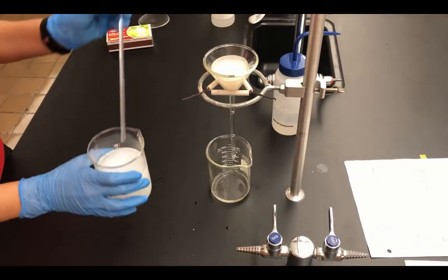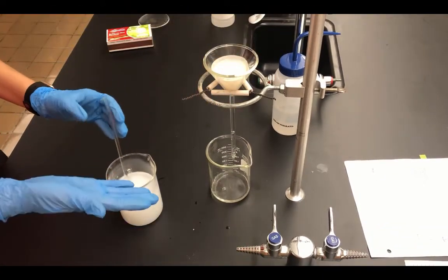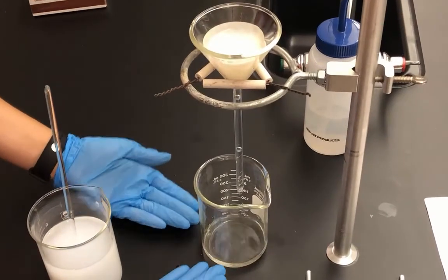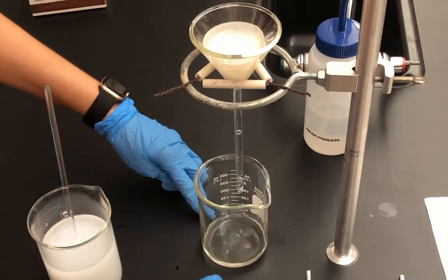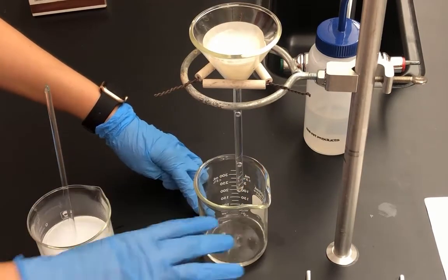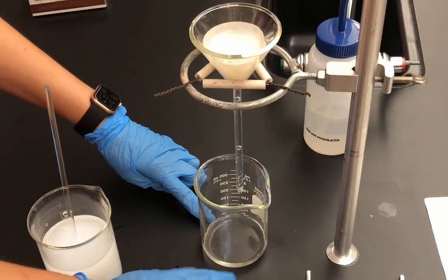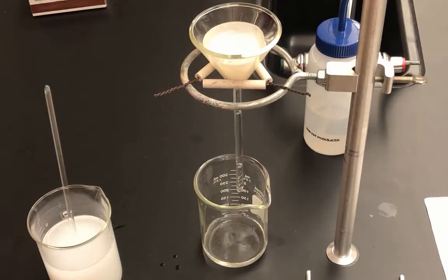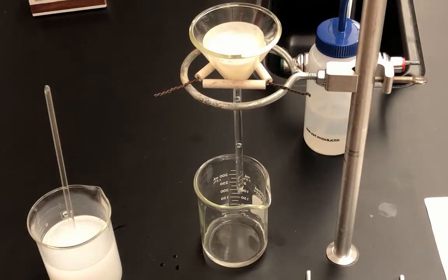Now I want you to make some observations. First, make an observation of the filtrate. So what is in the beaker down here is the filtrate. That's the aqueous solution that gets filtered through. Make an observation of the filtrate and make an observation of the solid. So what color do you see the solid so far?